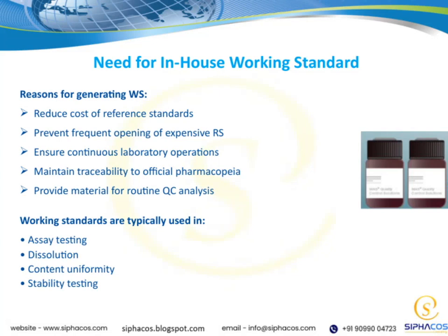Let's talk about the need for an in-house working standard. First, creating your own working standards helps to reduce the cost of reference standards, which can be quite expensive when purchased commercially. By generating your own, you also prevent the frequent opening of these costly reference standards, helping to preserve their integrity and extend their usability.